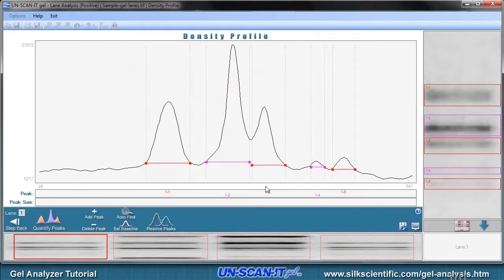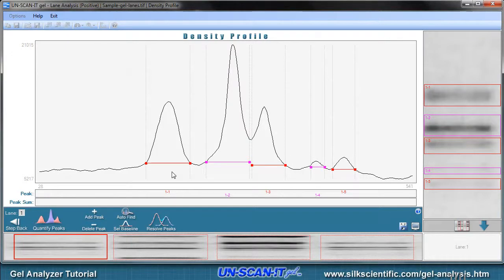Additional details regarding the density profile screen will be discussed in another video. The Unscannit Gel software will attempt to automatically identify the peaks which are associated with each band in the lane. Peak baselines can be added or deleted using the buttons located at the bottom of the density profile. The end points of each of the peak baselines should be located at the local minima at the edges of the peaks. You can use the mouse to drag the baselines to the desired locations.